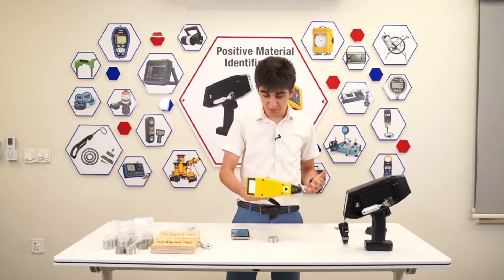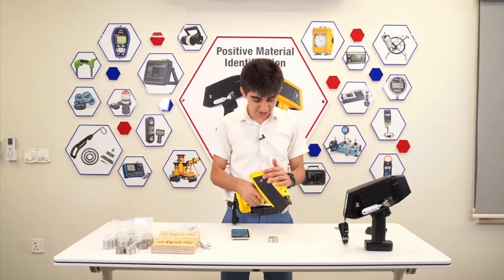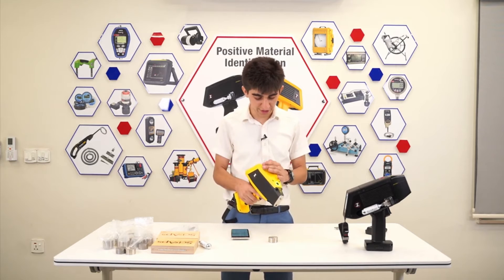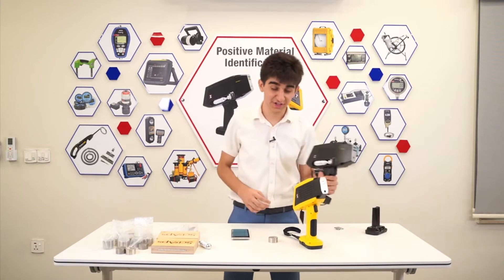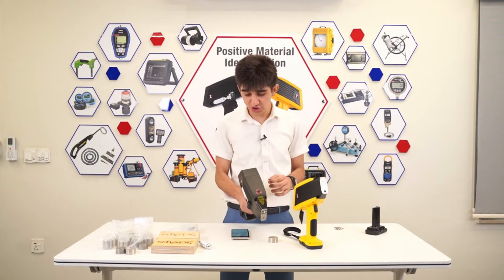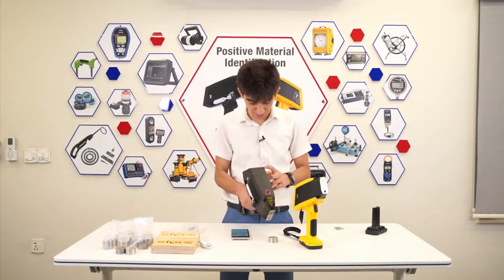As you can see, using this handheld unit is pretty easy and pretty lightweight. This one is the XRF technology. Now, if you take a look here, I have the LIBS technology. With this unit, you can also detect carbon, since it's LIBS technology.